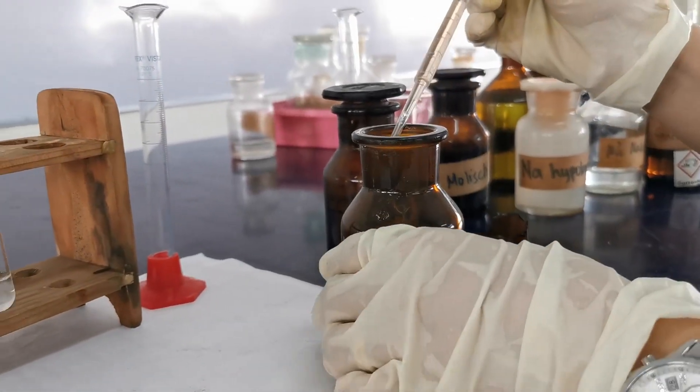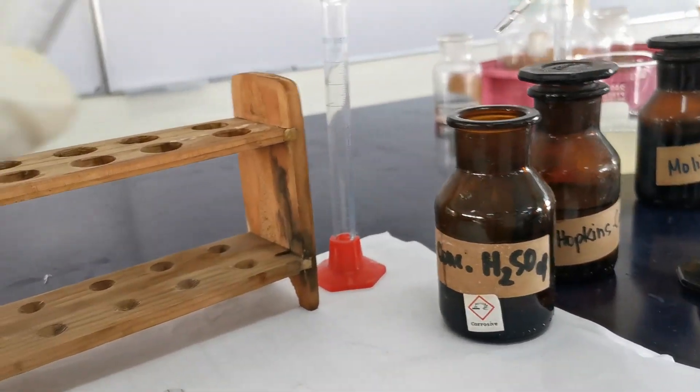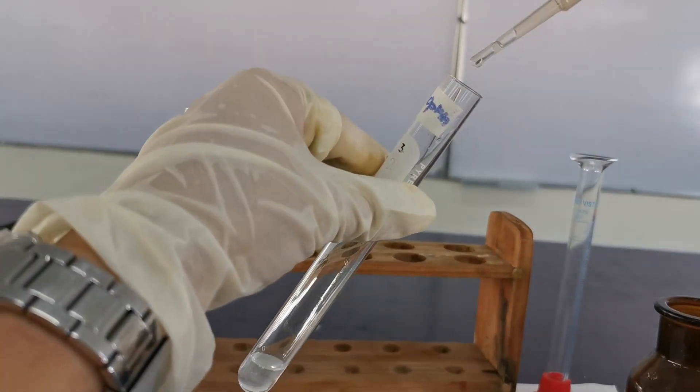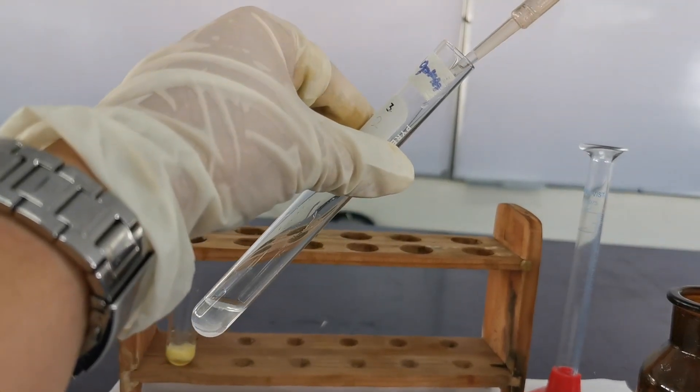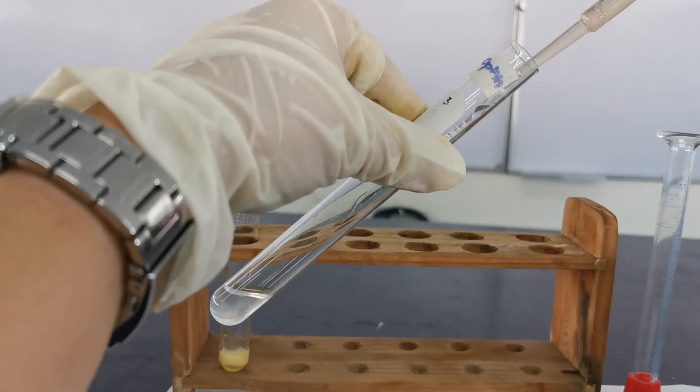Incline the tube and allow 10 drops of concentrated sulfuric acid to flow to the side of the tube to form a layer of acid beneath the protein mixture. What is the color produced at the point of contact of the two liquids?